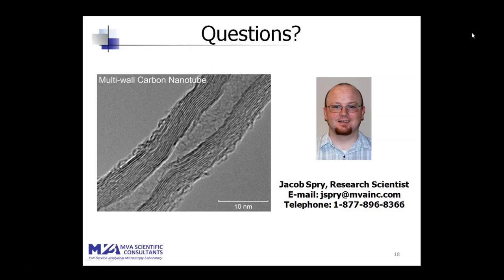Can transparent materials be characterized, like polystyrene, to explore defects in molding such as strain? I've never tried it, so I don't know the answer to that question necessarily, but that's part of the reason for, as Ming mentioned, developing that database, so that I can have that experience of looking at as many different materials as possible, attempting to find some lattice and do other types of characterizations of these types of materials.